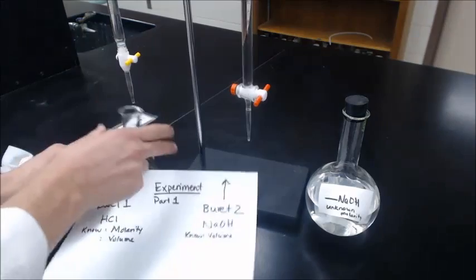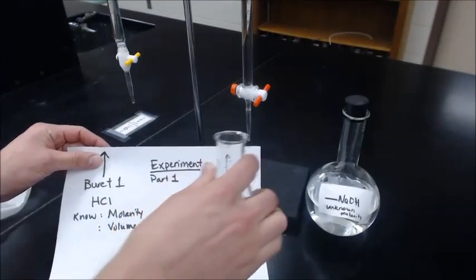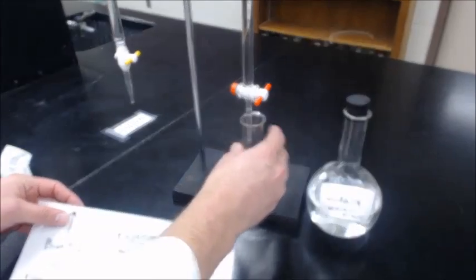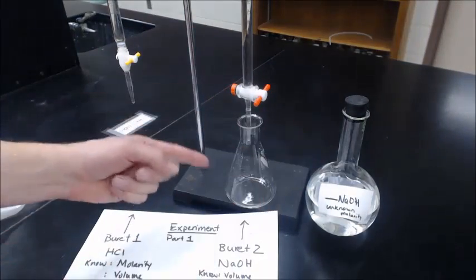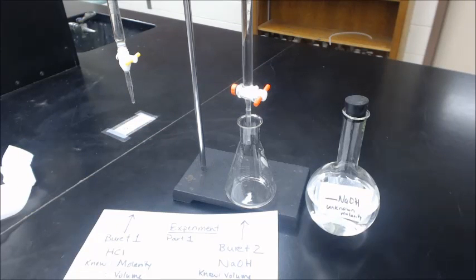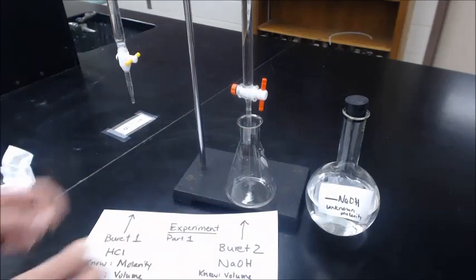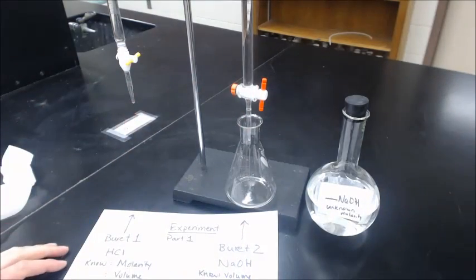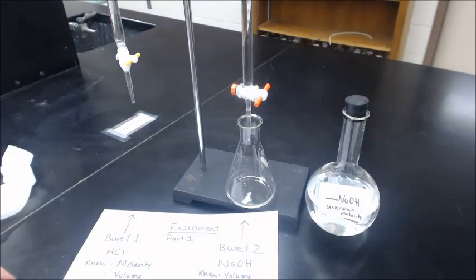In the second burette, you're going to have sodium hydroxide, the unknown solution. In this one, you're going to put some phenolphthalein in here so that at the end point it will turn pink as it becomes basic. You're going to start putting in sodium hydroxide and put in a known volume until it hits the end point and turns pink.